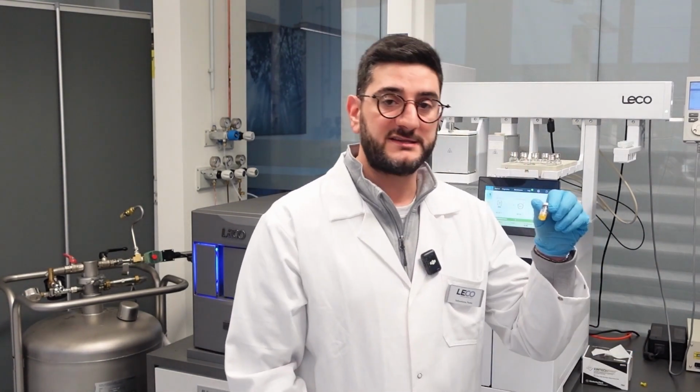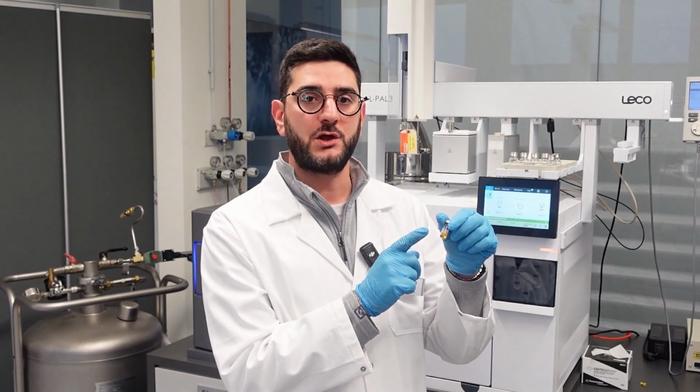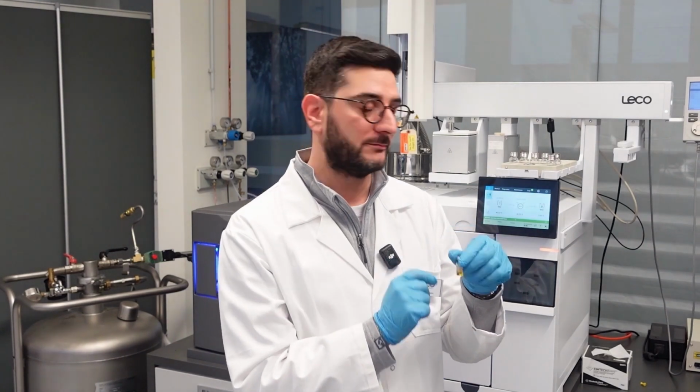As said before, today we will be analyzing a chili pepper extract. The determination of trace-level pesticides and contaminants in this type of sample is crucial to protect consumer health, ensure legal limits, minimize environmental impact, maintain quality standards, and finally facilitate international trade. This is the sample I'm referring to, and as you can see from the color, it's pretty yellowish. There were no cleanup steps applied, so most of the matrix is still within this sample.